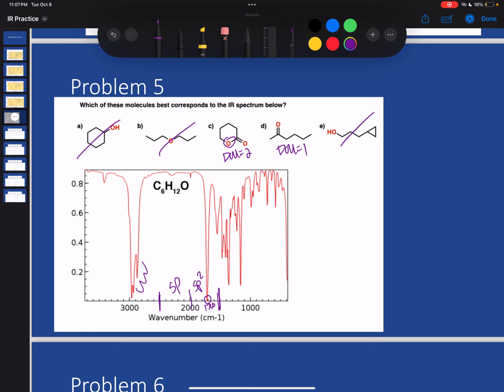So that's my thought process for this one. I don't know based off what I have what it is. I don't even want to tell you the guess because, like I said, we would give you more information than just this to distinguish between these two structures. All right, so yes, like I told you guys in class, there's not one technique that works for absolutely everything. So this is actually a very hard problem with what we're given.